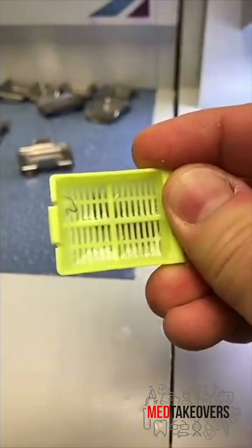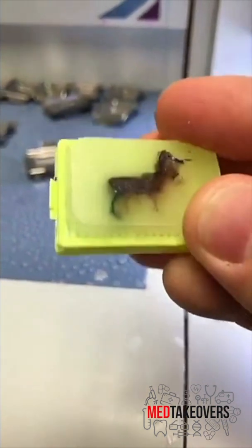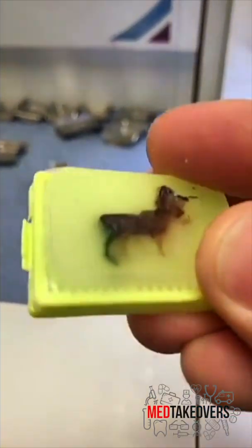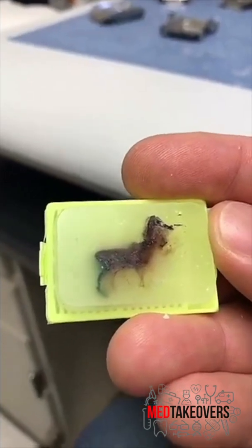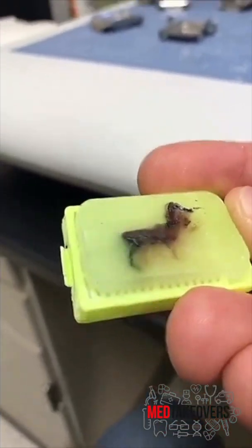The end result is that the tissue gets into this little wax block that we can then cut very thin slices off of. And yes, it's totally safe to handle these wax blocks with bare hands at this point.